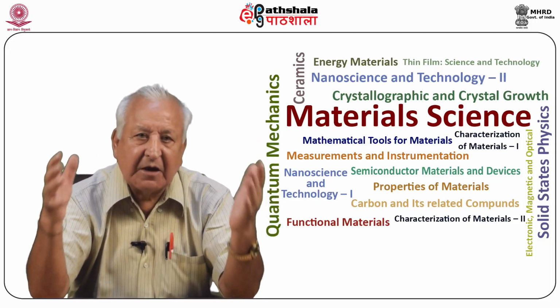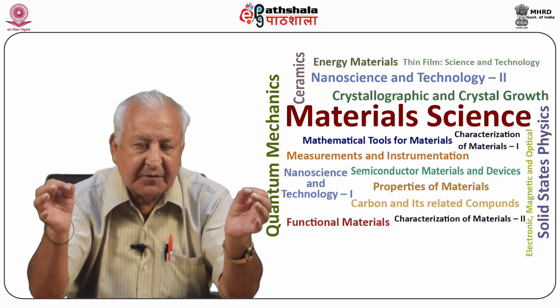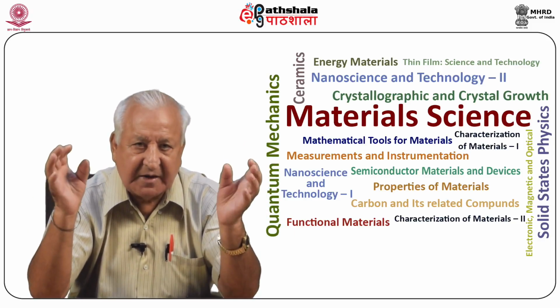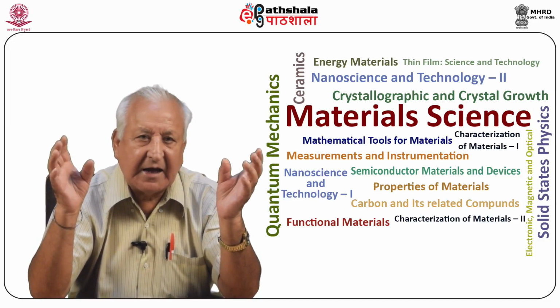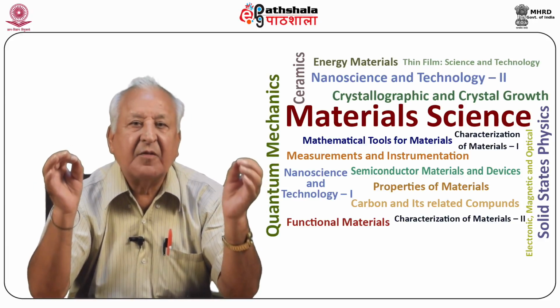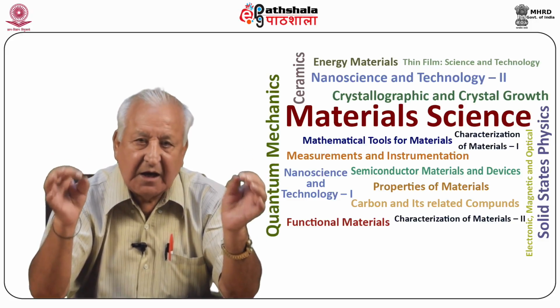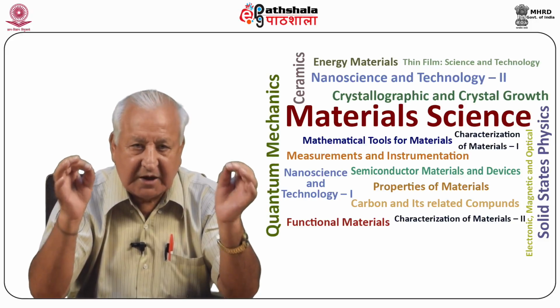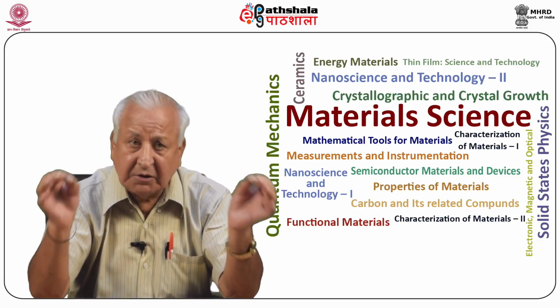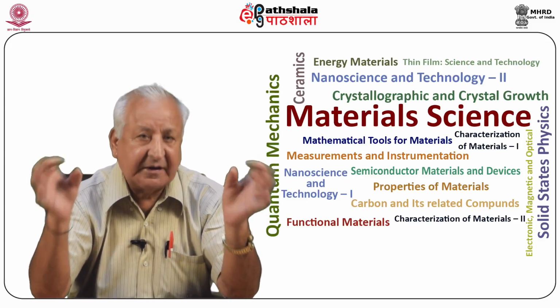The powdered crystal method. All the methods, be it Laue method or rotating crystal method, require a single crystal specimen whose size is greater than microscopic dimensions. However, in a very large number of crystalline solids, individual crystals of the desired size as required for the rotation photograph either do not occur or are not available. Such materials are readily examined by this method.